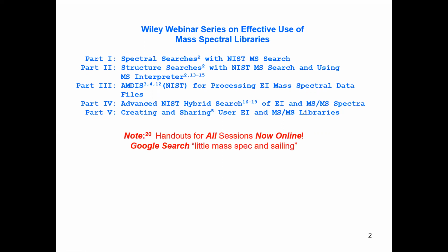There is more information. This is just an overview on the YouTube video, but the handouts really have the important parts about how to set up the parameters. To get the search to work properly, you need to know how to set up parameters. I can't show you all of that today, but there are screenshots in the handout that I think you'll find very useful as you go through it.